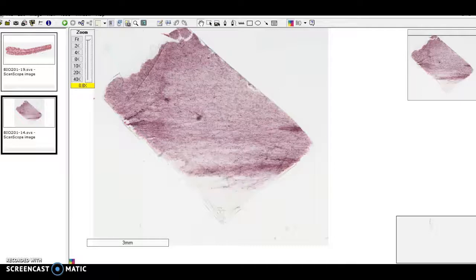It's a great place for a blood vessel to travel through. It's also a great place for white blood cells to walk around, or at least travel with amoeboid movement through that. You get the sense of space when you look at a loose connective tissue such as areolar tissue. This particular prep is from a membrane, like a serous membrane, the pleura or the peritoneum, that has been simply laid on the microscope slide.